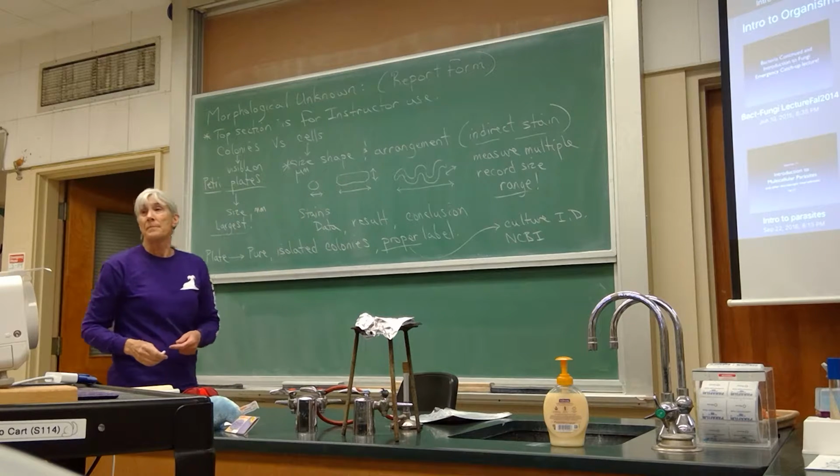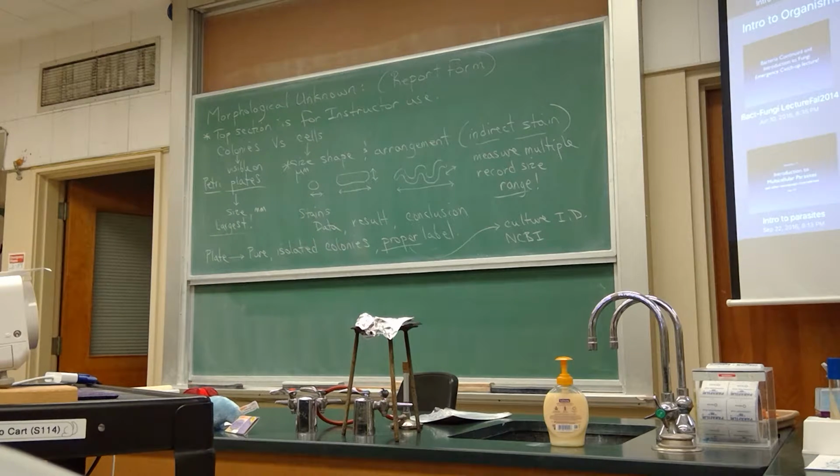And remember, the capsule is outside the cells. Don't draw the cells littler. So make them all the same size. In fact, you can make them the same size and the same shape. You just repeat the illustration 5 times and color them different colors. Indirect stain has a dark background. Capsule stain has a dark background. The rest of them don't. Okay? If you need paper, there's unlined white paper right there.